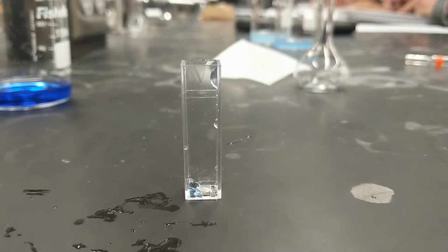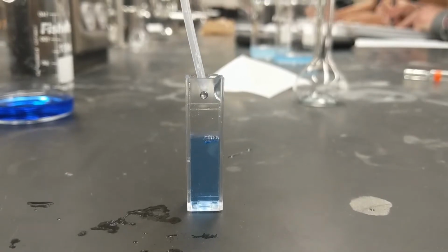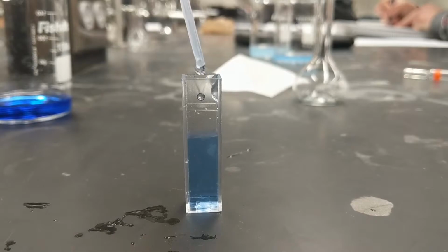After completing your 3 dilutions, carefully transfer your samples of each into their own cuvettes. Be careful not to go over the fill line. You will also need a cuvette of plain water as to zero out the spectrophotometer.